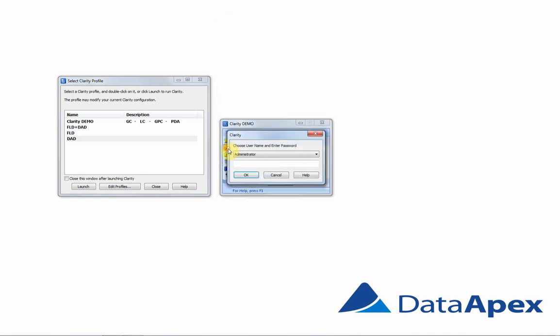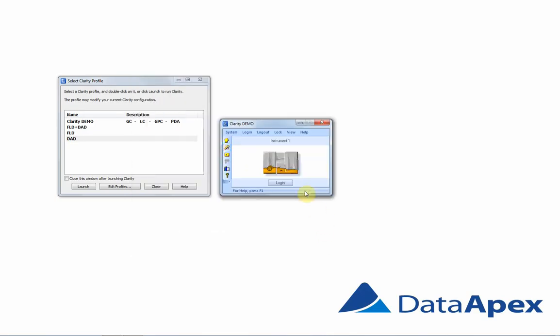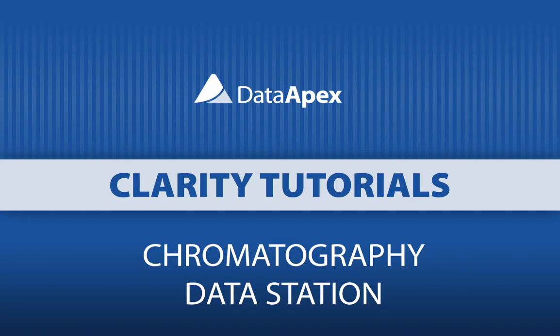If we want to double check the configuration, we can go to the system configuration and check that we have only the DAD without FLD detectors. Everything is working correctly. And this is basically how to start Clarity with a variable configuration.